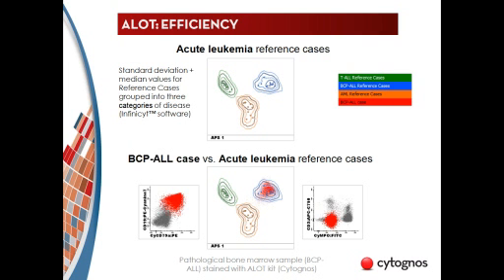So we can be sure that applying the ALOT in combination with the multivariate analysis that Infinicyt is offering, we can have the orientation to the B panel. So you just need to use the ALOT combination, gating on 45-34, and then the multivariate analysis is going to give you which lineage is present in your blast cell population.